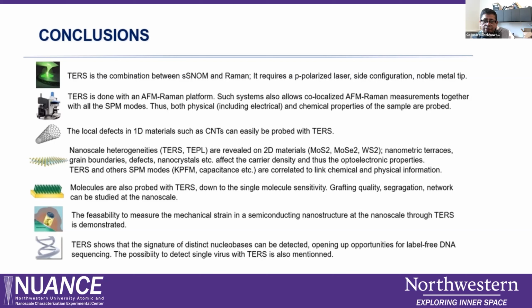One more thing. You were talking about the low temperature and high temperature experiments. So what temperature range will the stage have? Right now we have the Linkam stage, but we are trying to acquire a liquid helium stage through a core facility proposal. We already have the proposal in the pipeline.